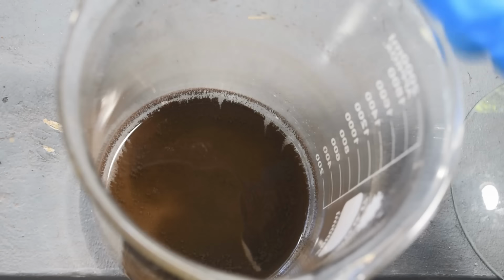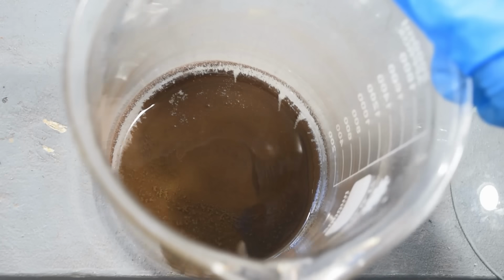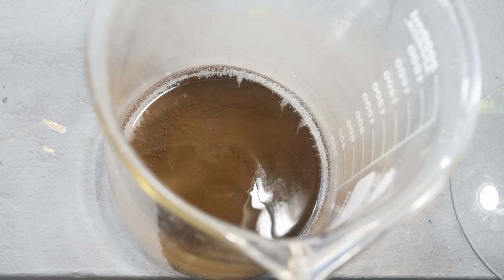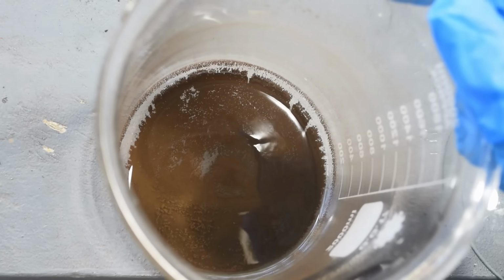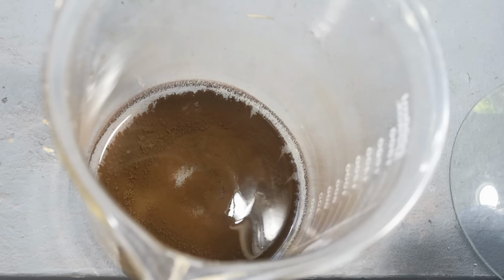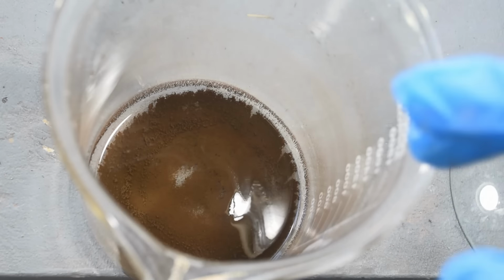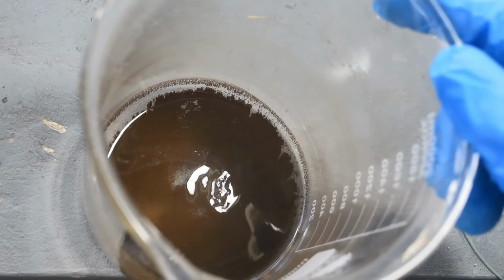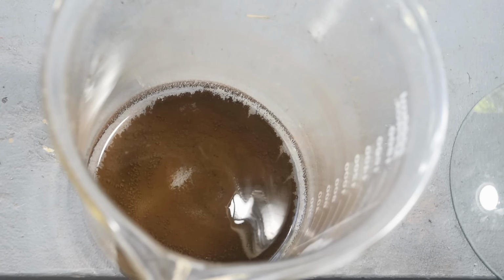Okay, there's our gold down there. Not too bad considering the number of chips I ran. I don't know if it's showing up, but there's a film of gold all around the inside of the beaker, which tends to happen when the gold is colloidal. So I'll put this back in the fume hood, I'll put some distilled water on it, and I'll start it boiling. And we'll see if everything cleans up, if the gold consolidates and conglomerates together. If it stays colloidal in the liquid, though, we'll have to take more drastic measures to clean it up. But let's see what happens with a water boil.